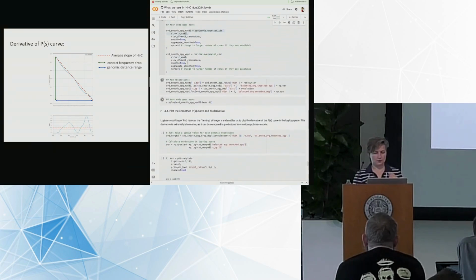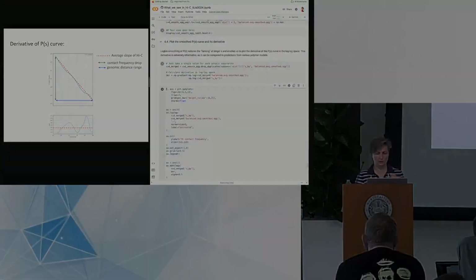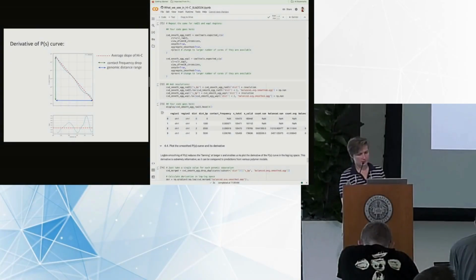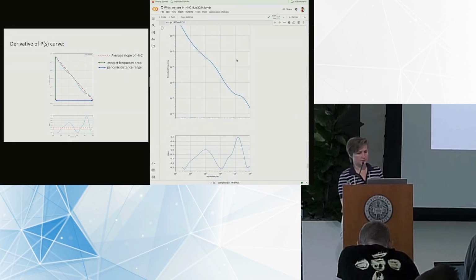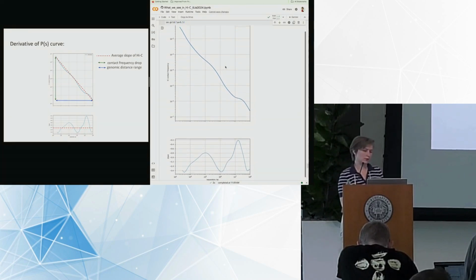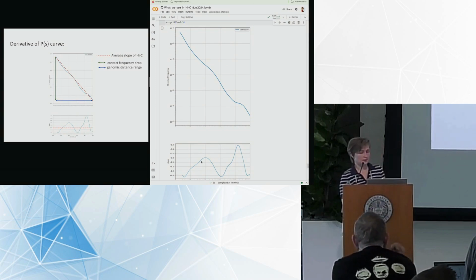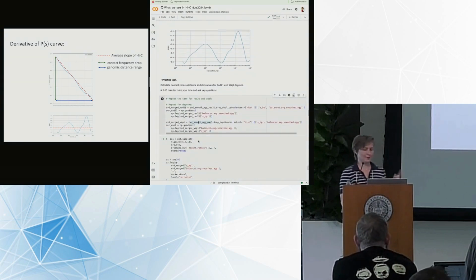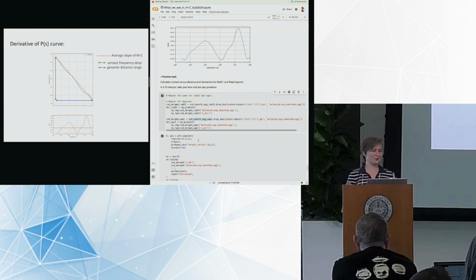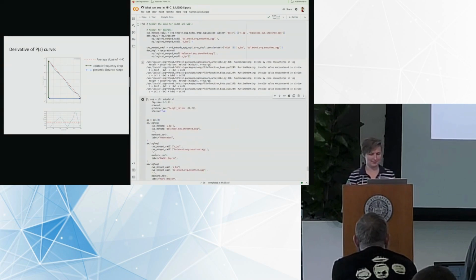So run the rest of the code in section 4.4. Perfect, I have it completed. And here it goes. Here is the scaling plot for the wild-type data with the first derivative. And as the next task, I ask you to plot the same, but for Rad21 degradation. One more tricky thing here is that I include one more treatment of the data that I will tell about later, but let's try to plot both of them at the same time.